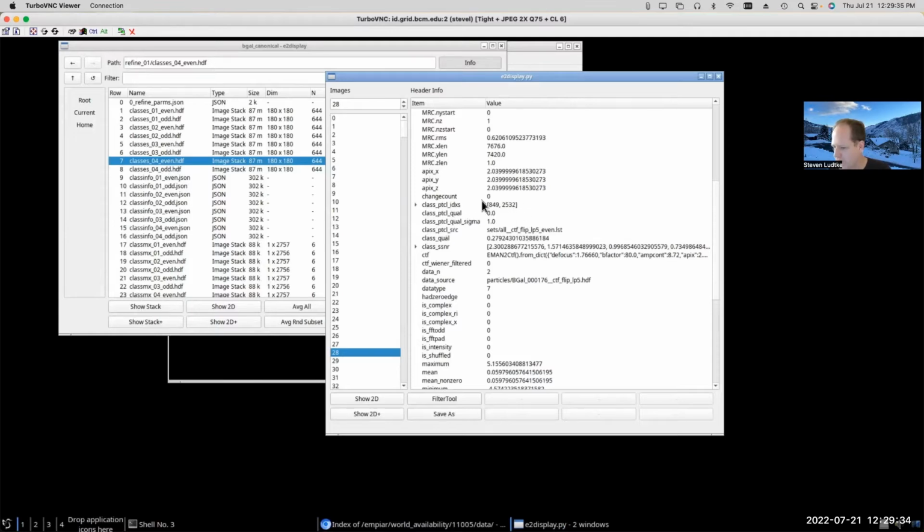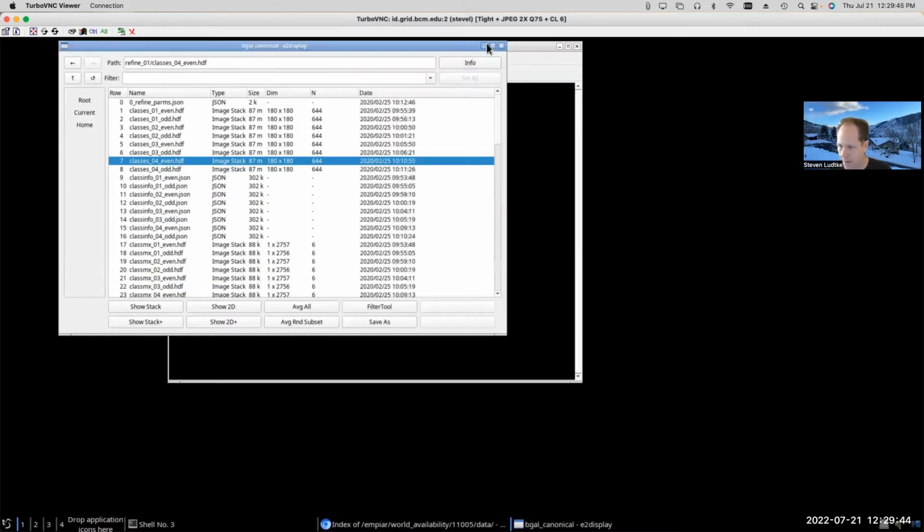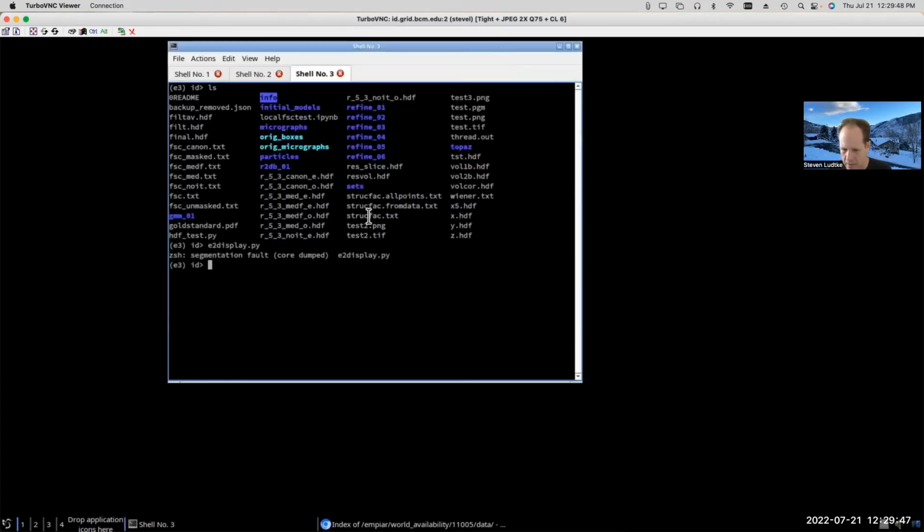Anyway, this sort of flexibility is one of the reasons why we went that way with the JSON file format. Now recently, with the pre-EMAN3 which we've been working on, we've actually taken another little shift. The JSON files are fine; they're human readable, but you kind of have to go into Python if you want to really parse them out. And there are some complexities associated with that.